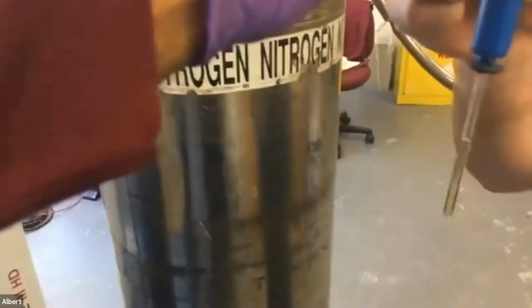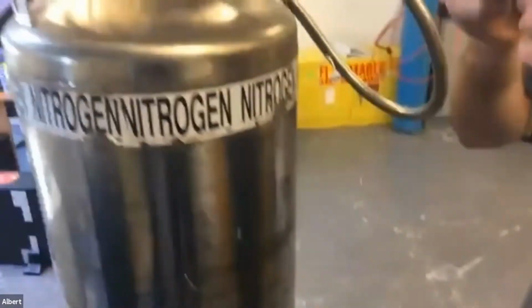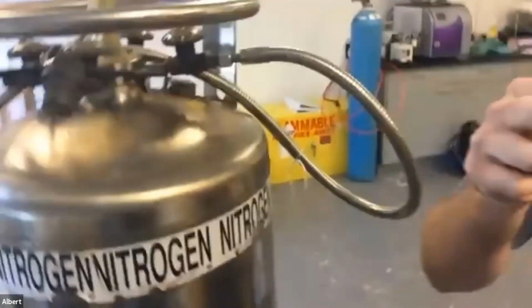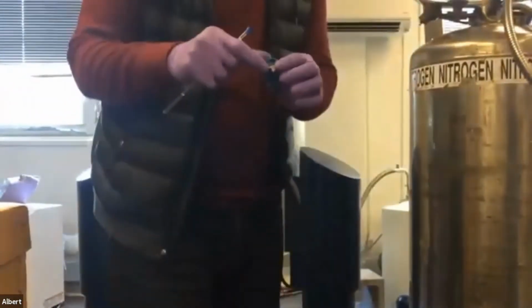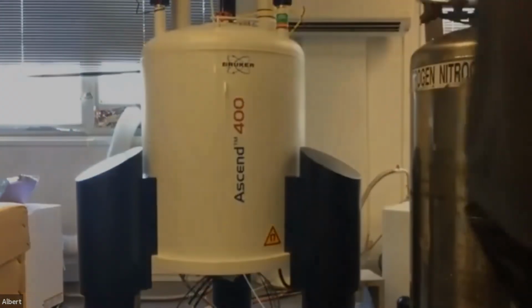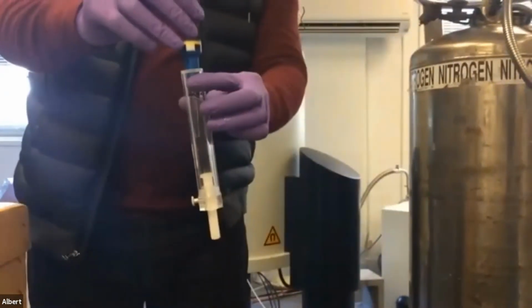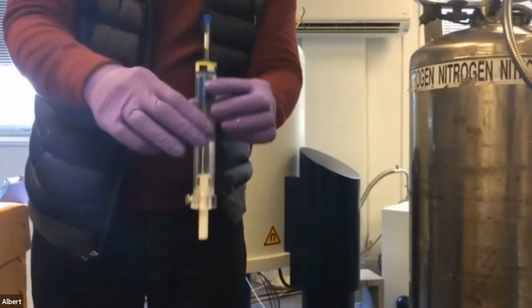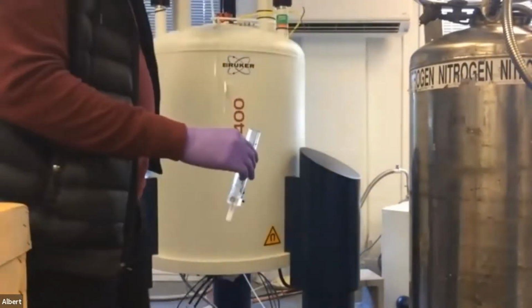So if you would, Eli, slide that spinner off of there. Just slide it straight down. All right, so that's the spinner, and that's the sample that was in there. So we're going to take the spinner now and put our sample in. So take this, I'm going to put this into here, like so. And then I need my depth gauge. This is my depth gauge. I always use this to know how far to push my sample down. So I'll push it down until it stops. Right? And when it stops, I can now put this into here.